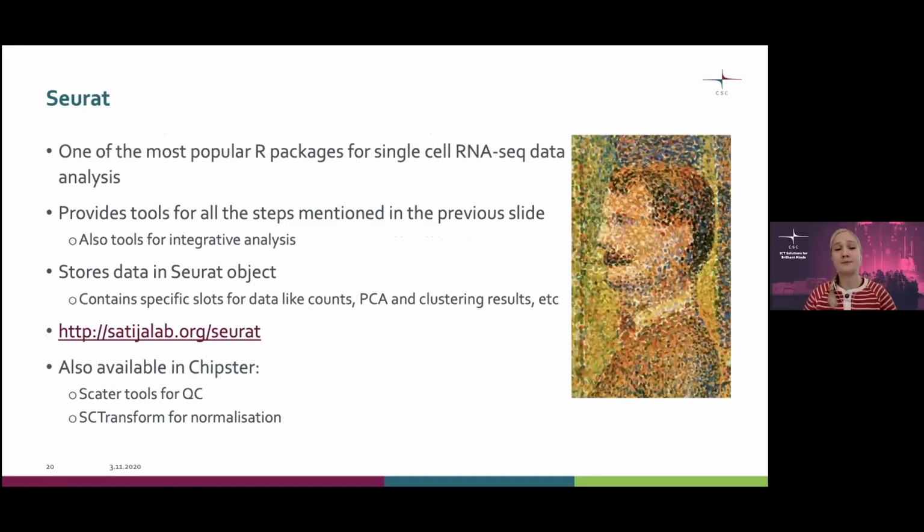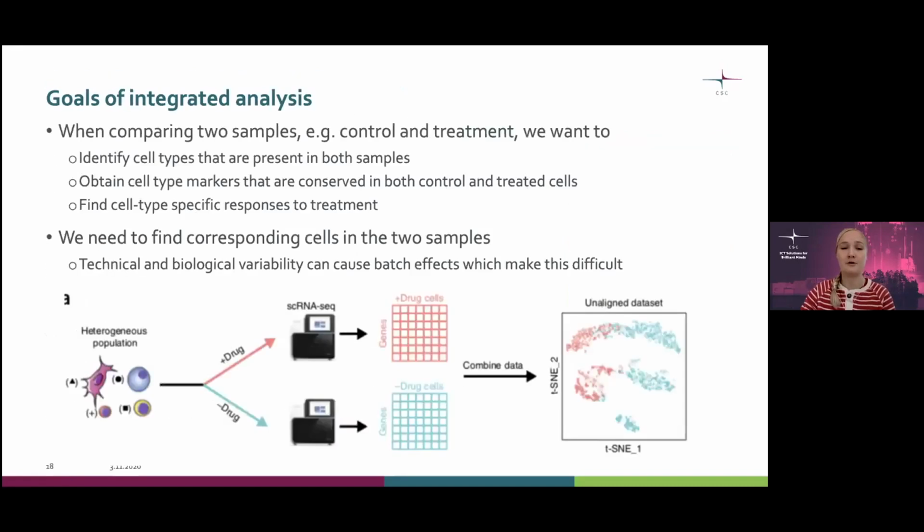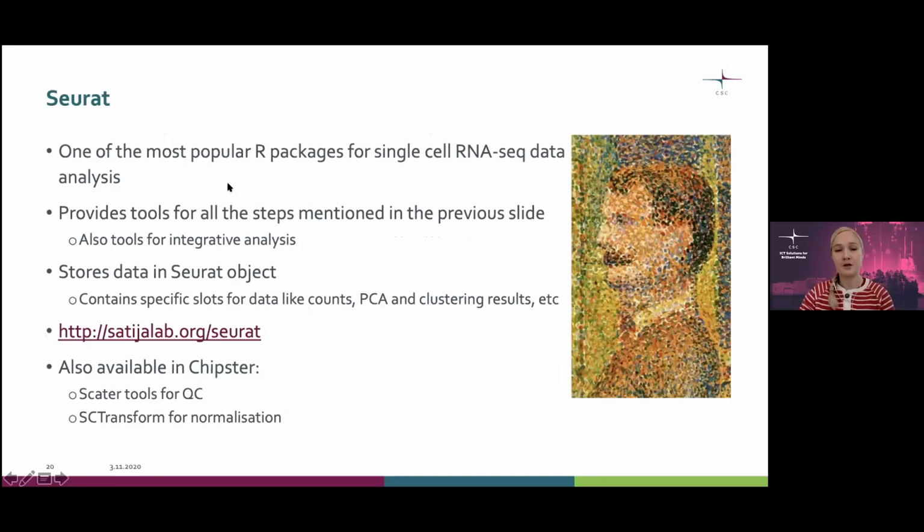Important thing to mention. In the exercises, we are using these Chipster tools, which pretty much follow these steps mentioned here. However, we haven't developed the tools within.